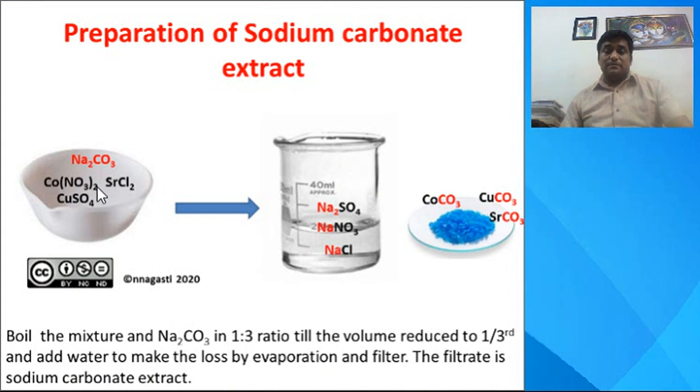Remember, the mixture is there. We take one part of the mixture and three parts of solid sodium carbonate. The idea is that the mixture should be treated with excess sodium carbonate, and then by adding water, we heat it till the volume gets reduced, and again add water to make up the loss by evaporation. Then filter it. What we get is a filtrate and a residue.